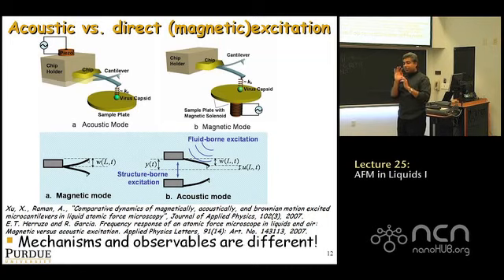So you've got some sort of a plastic base, and you've got a place to put your chip and clip the chip on, and the piezo is typically on the back side of it, shaking. So the piezo applies an alternating expanding motion like that, and that vibration is then transferred to the chip holder, to the chip, and from the chip to the cantilever.